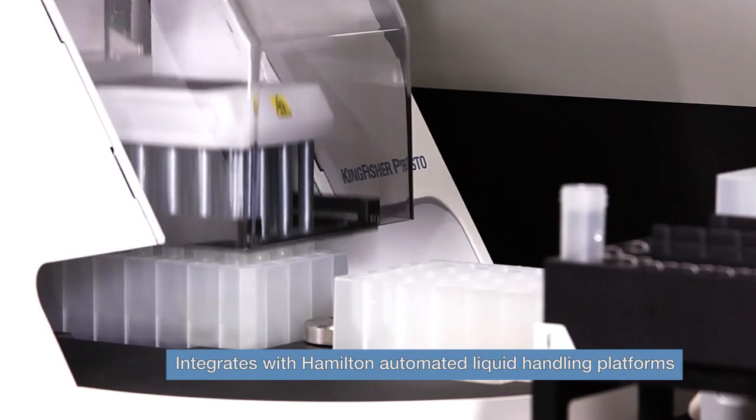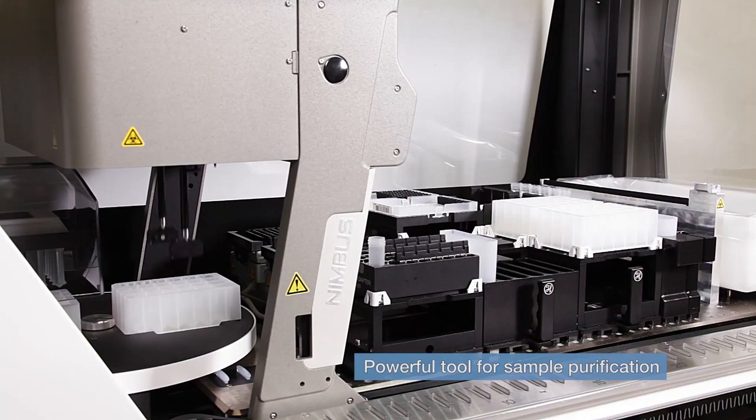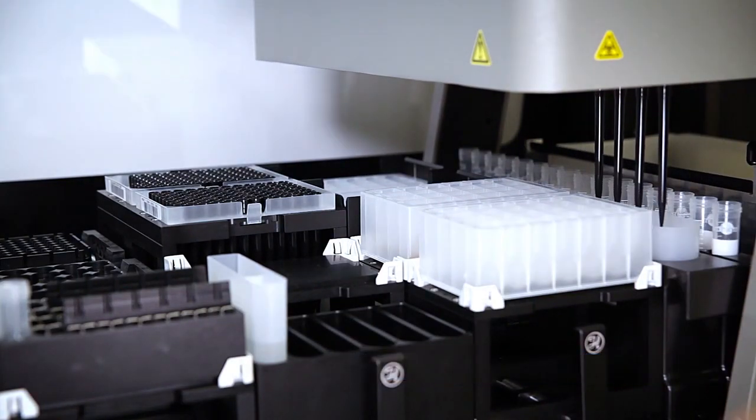With the Kingfisher integrated with Hamilton automated liquid handling workstations, you can improve daily extraction processes and gain confidence in your sample handling and preparation.